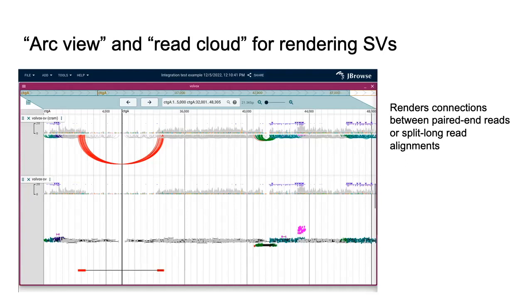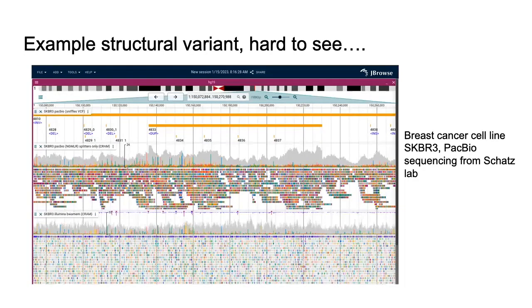It's a lot to explain, but I think that when you're exploring the structural variants, you start getting an intuitive feel for these types of things. And this is a toy demo, or a toy data example that I synthesized, but I looked at how it might be for real human data. So this is a large duplication that was called by Sniffles on some PacBio data. And this is what your normal alignments track might look like.